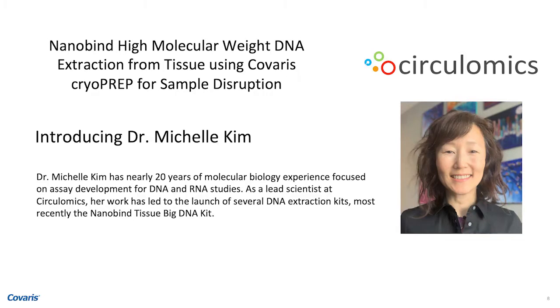Thanks, Tom, and thanks, Tamlin, for the introduction, and thank you to everybody who's here today to learn about extracting high molecular weight DNA from mammalian tissue using Covaris cryoPREP for sample disruption and Circulomics Nanobind for DNA extraction.